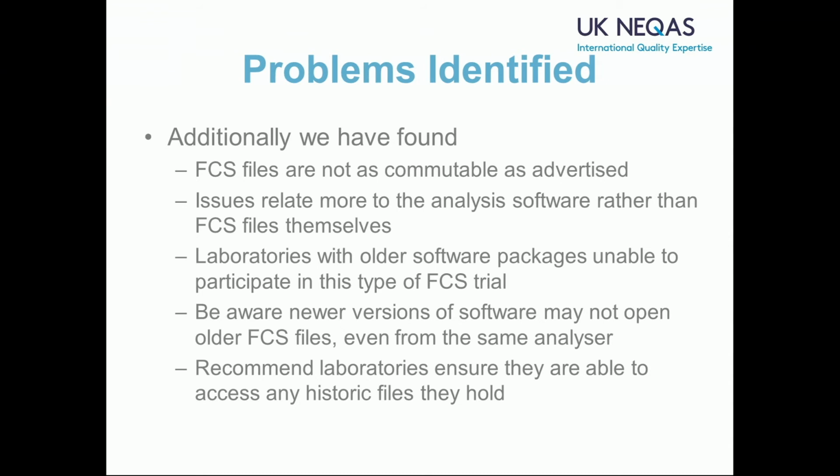We know that people store files for several years. If you are going to do an upgrade, maybe keep your old version and put the upgrade on a separate computer to check that you can open some of your legacy files. Otherwise, you're just going to have a hard disk full of FCS files that you can't do anything with.